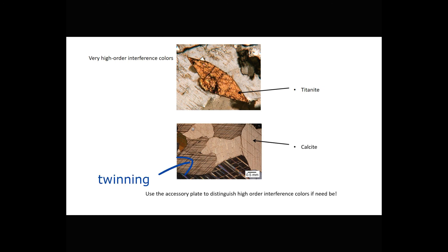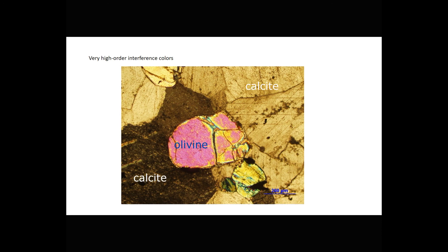One important diagnostic feature for calcite is twinning. You can see it here in this cross-polarized view as diagonal intersecting lines and stripes. Sometimes the twinning is visible in plain polarized light as well. We saw this view just a minute ago when we were talking about olivine — the grain in the center is olivine, but most of the material around it is calcite. You can see vague twinning in these grains, but seeing interference colors requires a very active imagination.